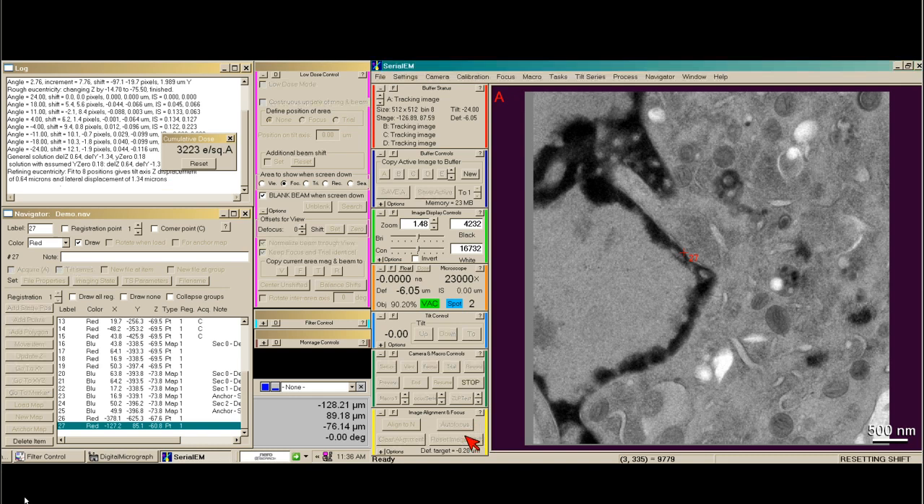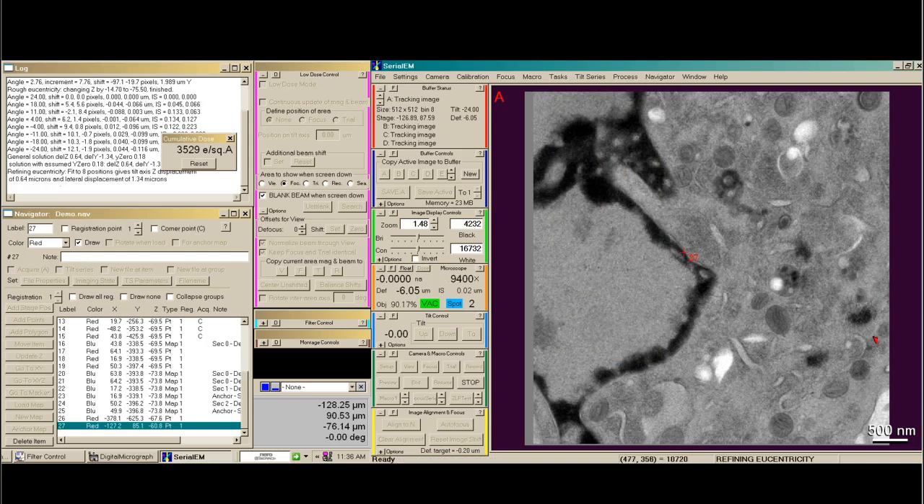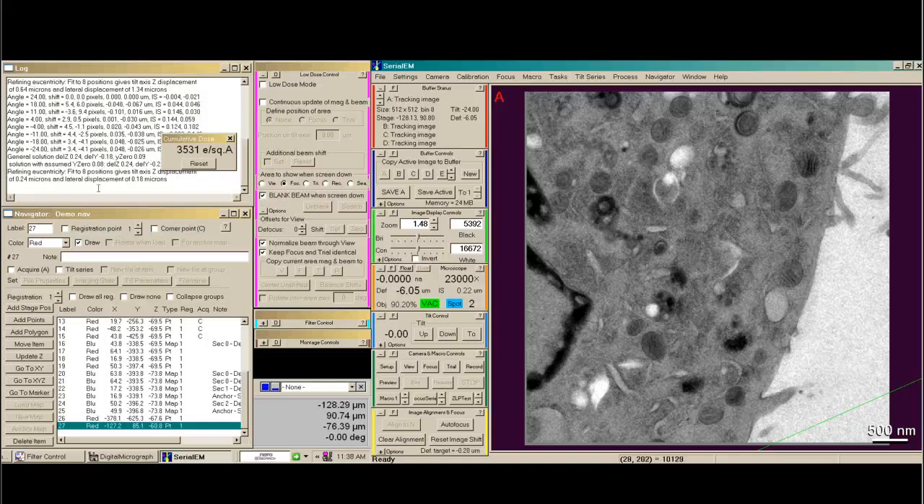You'll see that we've now accumulated an image shift equivalent to the lateral displacement. So I'm going to reset the image shift and then just make sure that my aperture is still centered. Then I like to do fine eucentricity again, just to make sure that this wasn't an anomaly. Fine eucentricity has finished, and you can see our lateral displacement is much closer to zero.